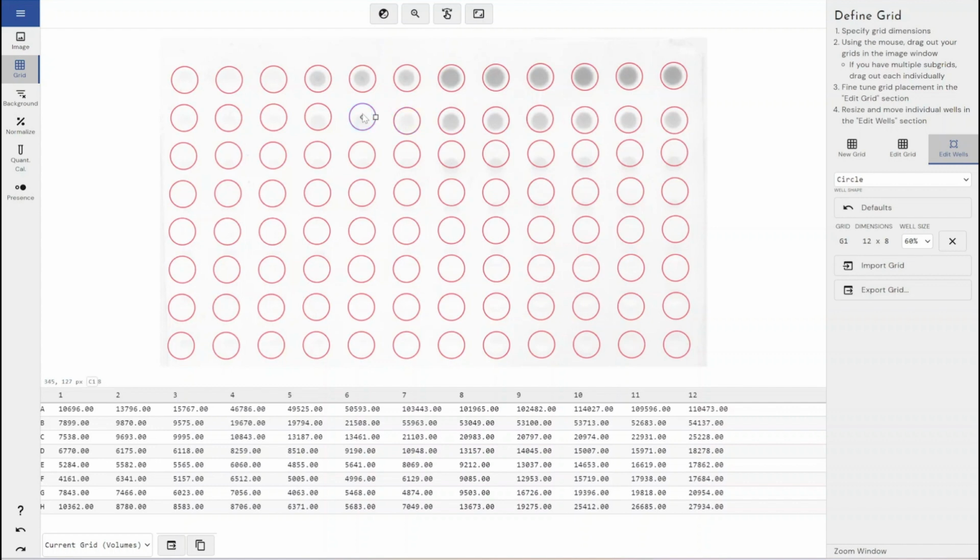And whilst I'm speaking about the flexibility of the software, of course, being a TotalLab product, it's able to be integrated with our 21 CFR or GxP solution. So if you did want to harmonize your lab onto our software with all your different plate readers in a 21 CFR compliant manner, that's completely possible with our Phoretix Array software. You can have your operators trained in only one piece of software and maintain only one piece of software to do all of your analysis for all of your plate readers within a regulated environment.